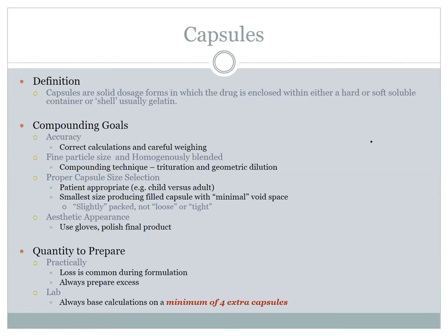By the fifth time of you manipulating that capsule, it's all dusty, it's all bent because you've been squeezing on it, and it's gotten some fingerprints on it, and it's a mess. So at that point, you need to just dump the powder out and start all over again. Because in the end, your capsule that has the right weight of powder has to be nice and shiny, and pinched closed and so forth. So we're going to make sure that it has a quality appearance when you're done. Those are the main things we're going to use to evaluate your capsules today.